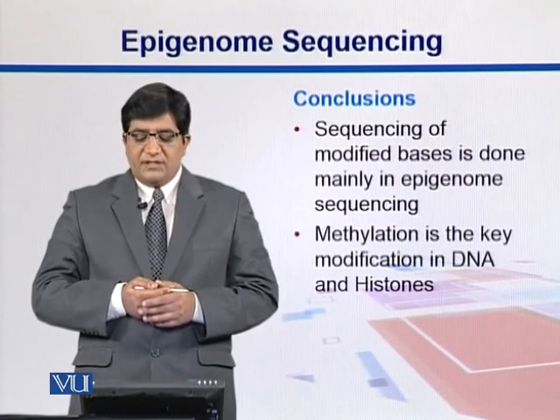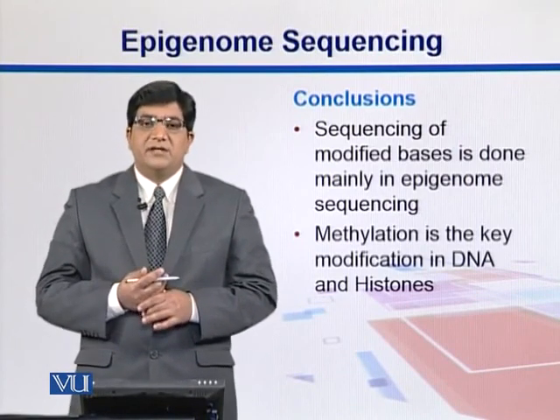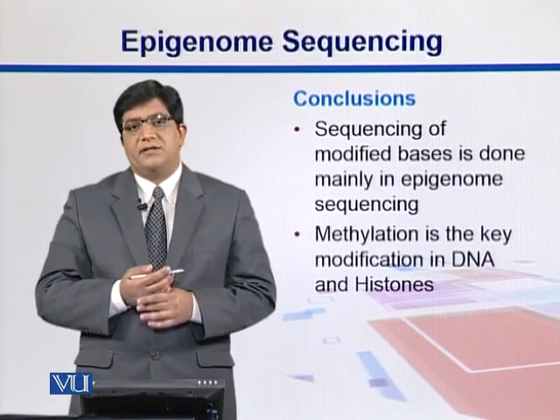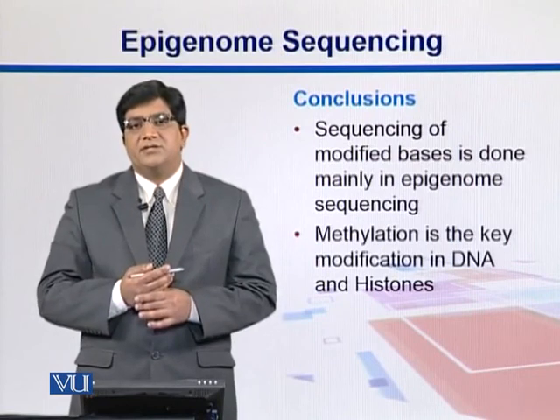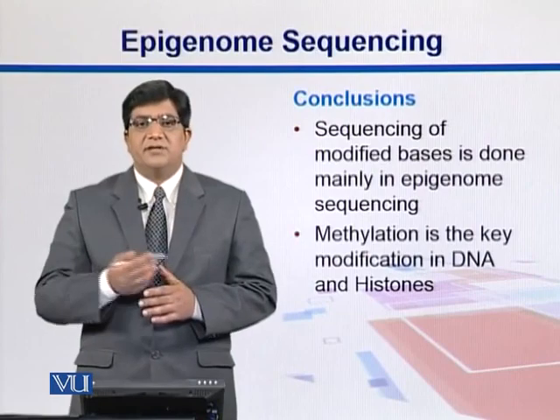So far, what we have seen is that sequencing of modified bases is mainly done in epigenome sequencing. Mostly we are interested in studying the methylation patterns in the DNA, and methylation is actually the key modification in the DNA.